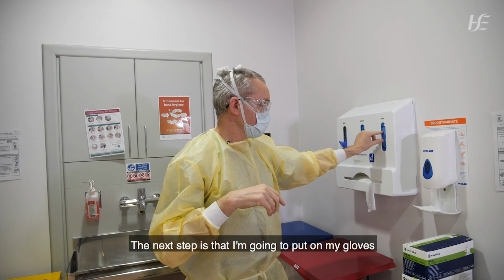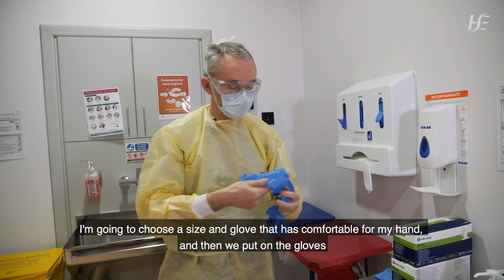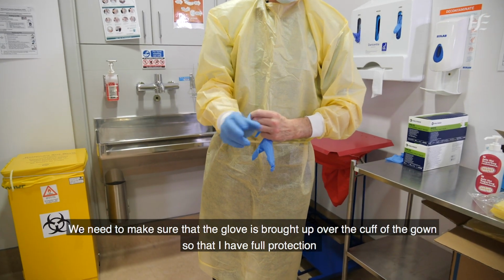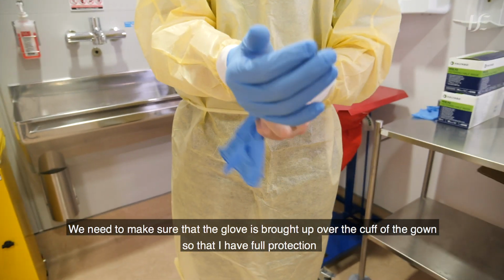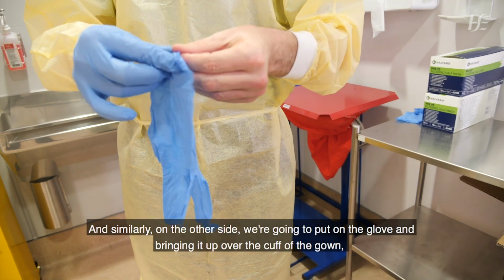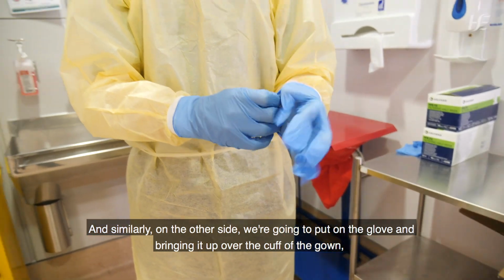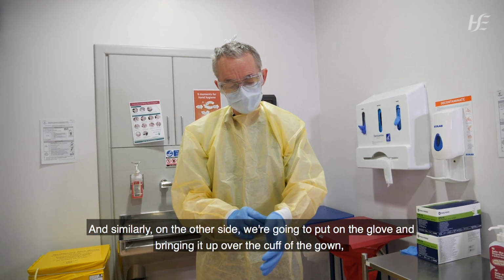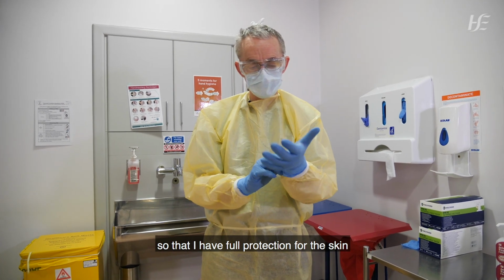The next step is that I'm going to put on my gloves. So I'm going to choose a size of glove that is comfortable for my hand. And then we put on the gloves. We need to make sure that the glove is brought up over the cuff of the gown so that I have full protection against the risk of contamination of my skin. And similarly on the other side, we're going to put on the glove and bring it up over the cuff of the gown so that I have full protection for the skin.